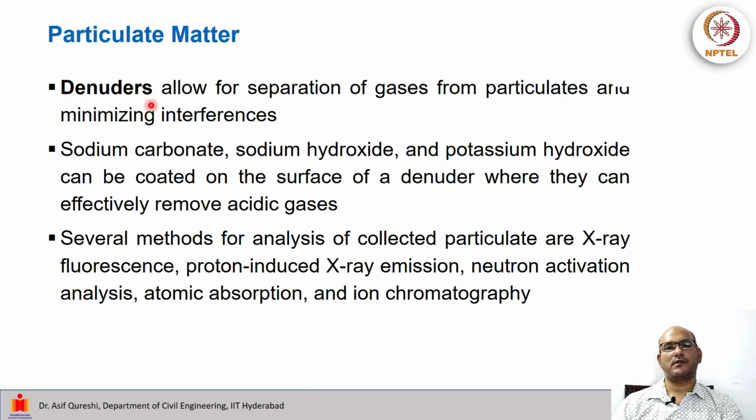Denuders for particulate matter may allow for separation of gases from particulates and minimize the interferences. And we can have sodium carbonate, sodium hydroxide and potassium hydroxide coated on the surface of a denuder, so they can remove basically the acidic gases.